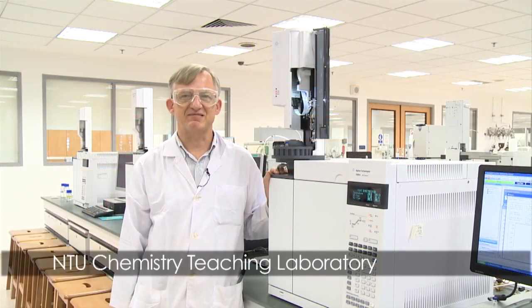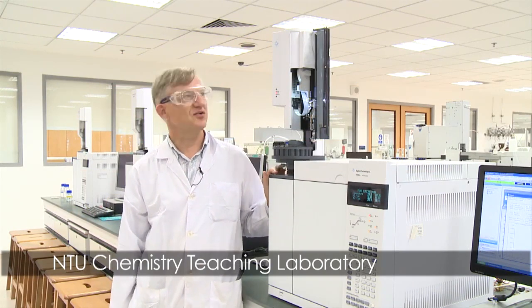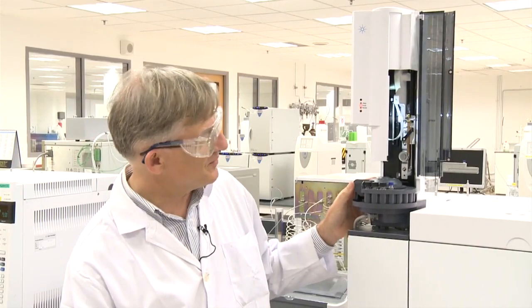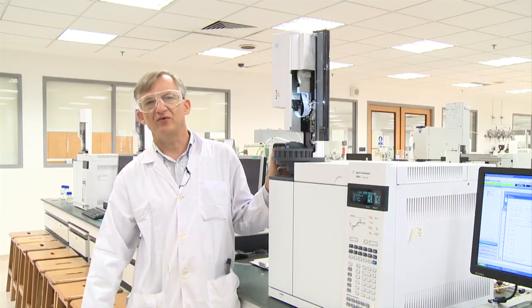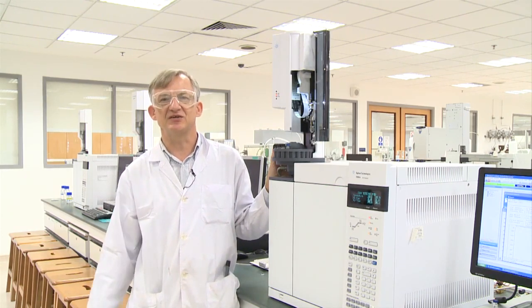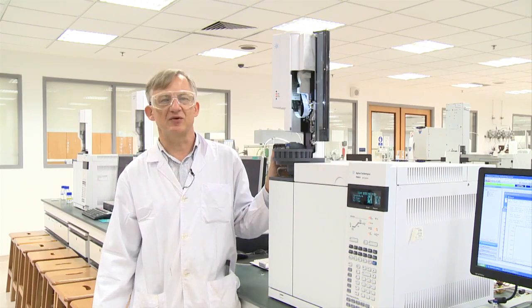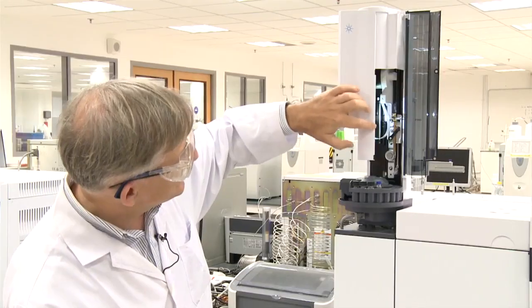This is a gas chromatograph, or GC, and this one is fitted with an auto sampler so that it can run multiple samples one by one. The autosampler is effectively an injection robot. The sample is injected into the instrument automatically by this syringe here.